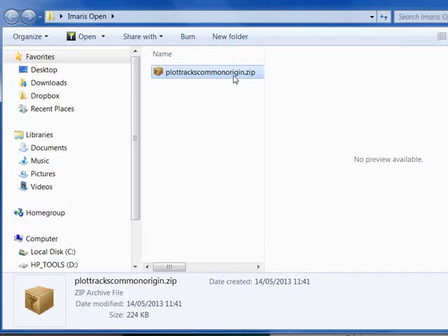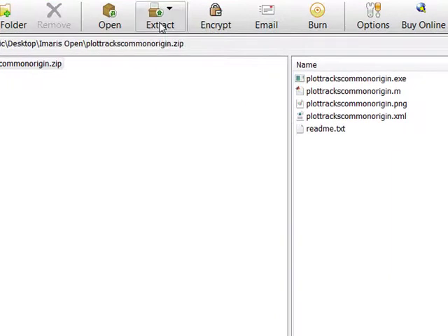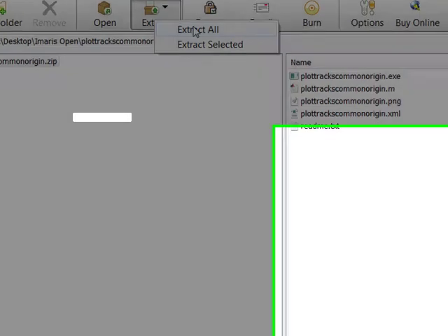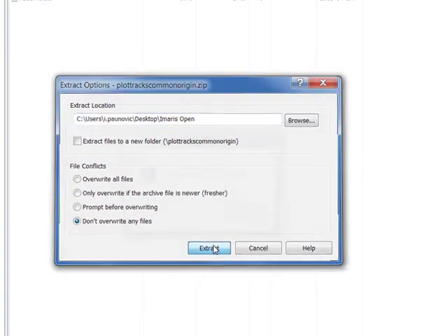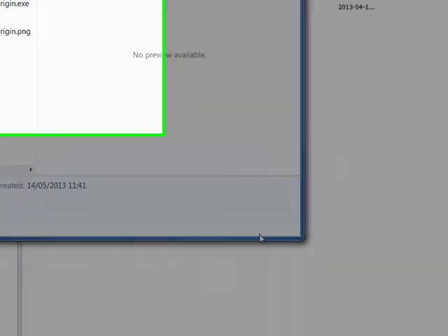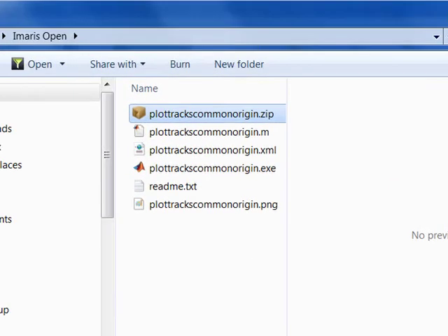When the download is complete, open the zip file and then extract it. The folder contains the MATLAB file, compiled extension files, the image test file and the instructions.